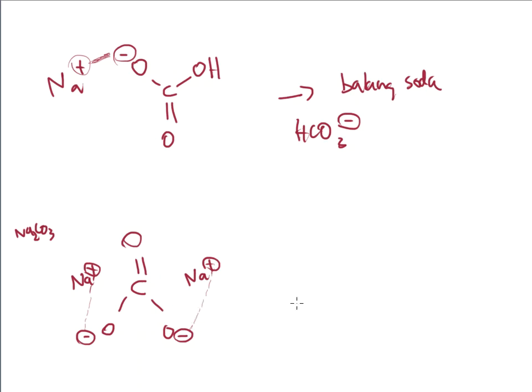So this is sodium carbonate, and this is what gives up my CO3 minus 2, and this gives me the combo of the mobile phase that I really desperately need in ion chromatography to separate the ions from each other.